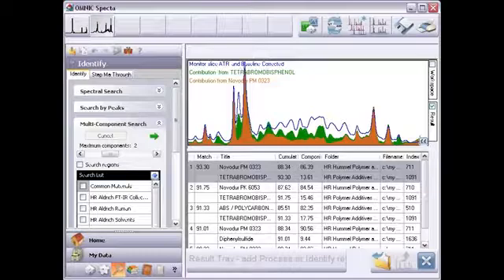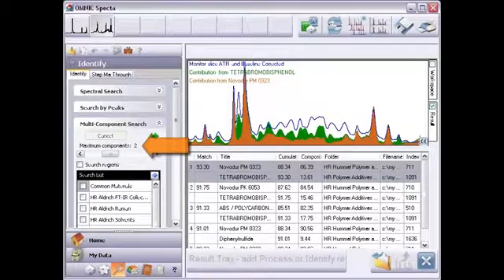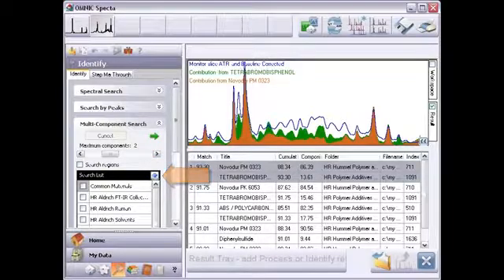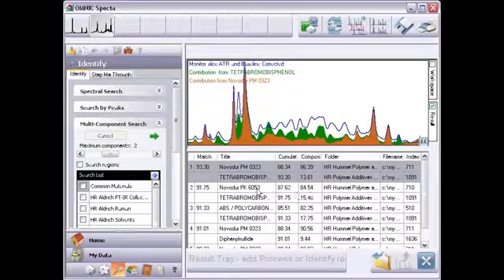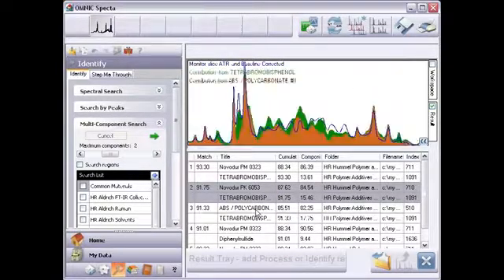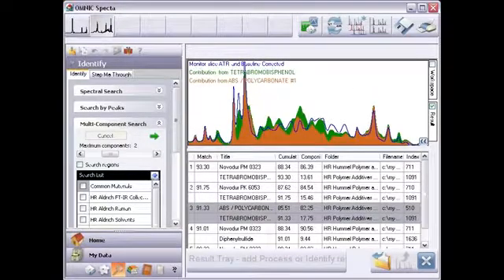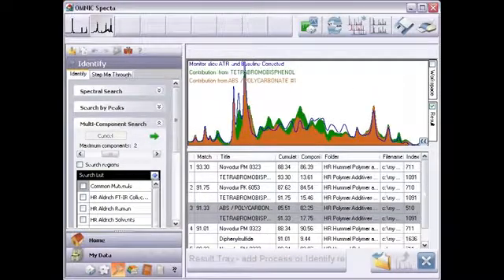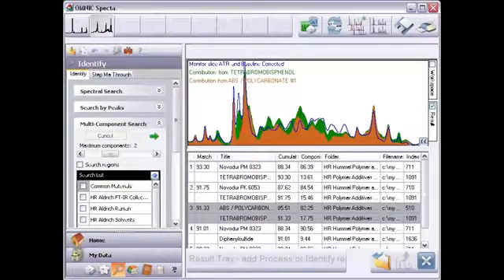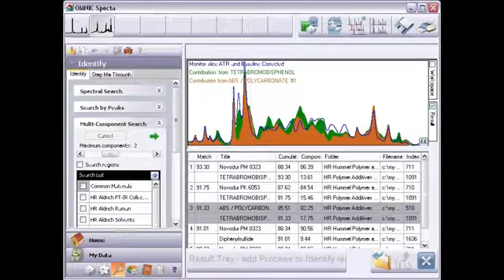If peaks are missing, you can increase the maximum component setting and rerun the search, or try using other libraries. If I click here to bring up the second match set, and the third, you can see they are also close, but each is incrementally more unlike the unknown. This exercise confirms that the first set of found reference spectra is clearly the best match.